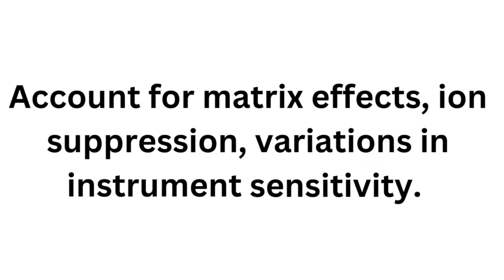Once again, the purpose is to account for matrix effects, ion suppression, and variations in instrument sensitivity, and so it's used in proteomics, metabolomics, and pharmaceutical analysis. Another setting is in NMR spectroscopy to ensure accurate quantification of compounds in a mixture by comparing the integrals of the sample signals to the internal standard. It's used in structural elucidation and quantitative analysis of small molecules.